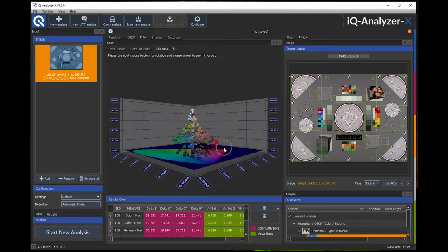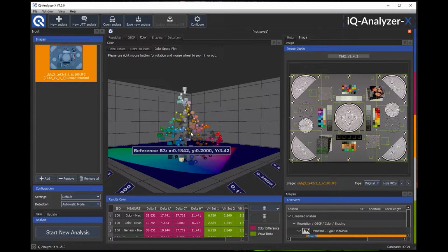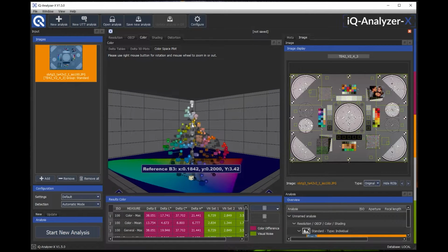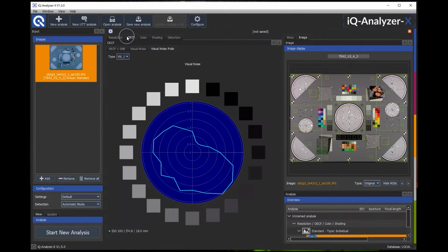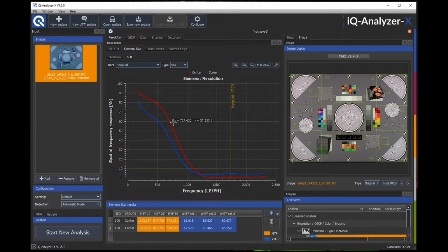Or here in a three-dimensional plot, where I can now go in and see details of my reference to the data. Okay. So you see, we have a very versatile user interface where you can always activate, deactivate plots and work with, and always adjust it to your need.